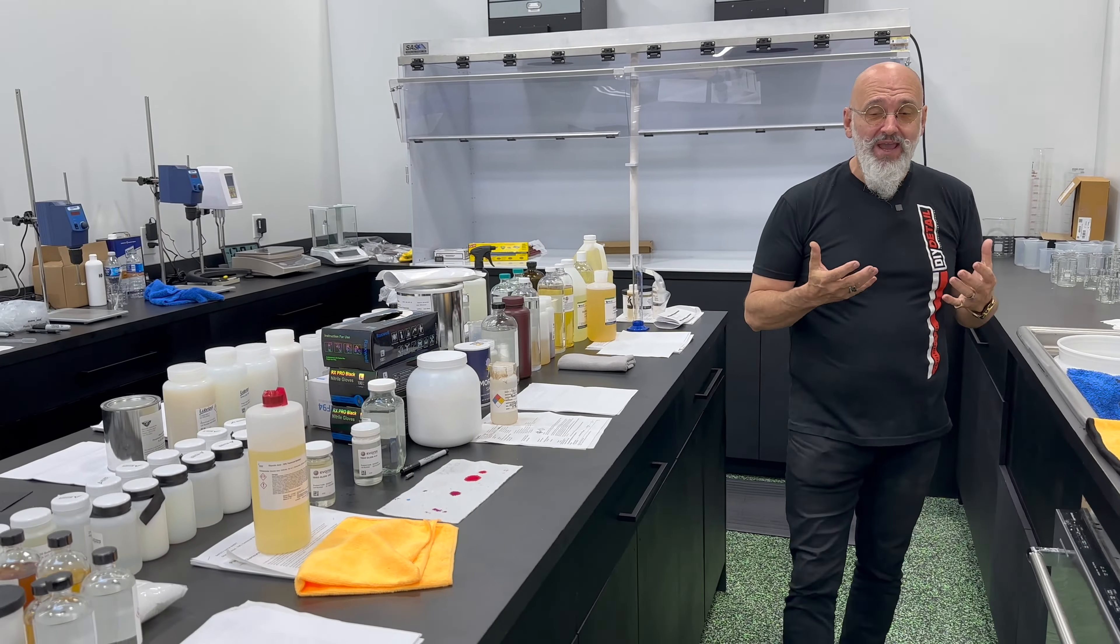We have different things of mixing. And this is fun, if you've never seen one of these, or if you don't remember chemistry in school. But there's a little magnet in here. And as this turns, we can actually create a little cyclone in here. Doesn't really do anything, but it's fun to watch.